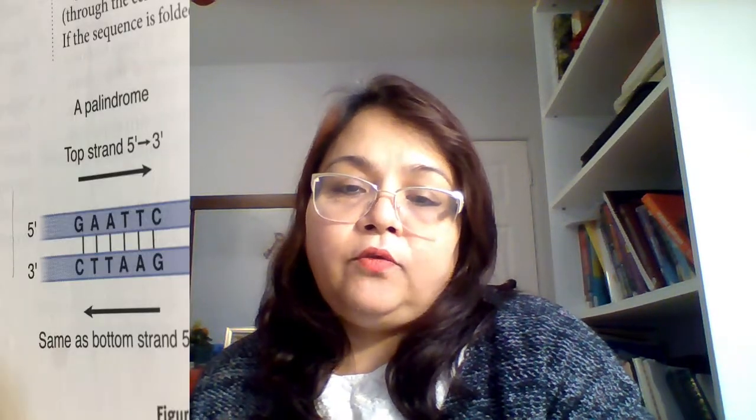to identify or differentiate this virus from other coronaviruses or other kinds of pathogen. The complementary DNA actually represents the original RNA retrieved from the pathogen, and like the original RNA target sequence, the complementary DNA will have the same target sequence.